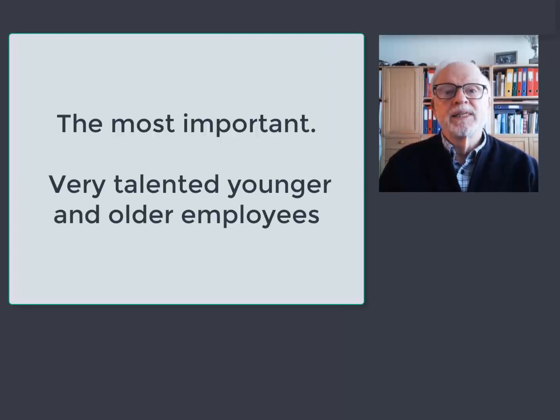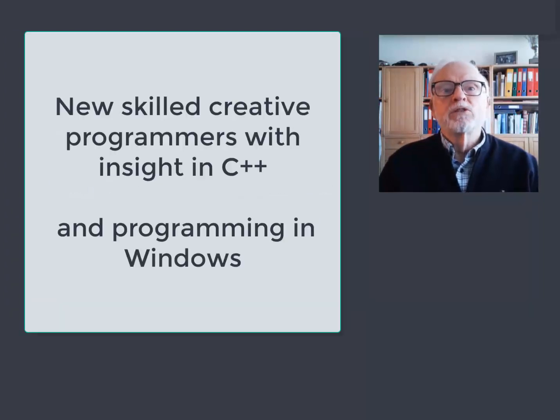The younger talented Labka programmers on the HP 1000 wanted us to get more familiar with the new technique on the PC side, something other than just Fortran on the HP 1000. They chose the IBM PS2, DB2 and the programming language C. That was around 93. We lacked solid knowledge and experience with object-oriented programming in C++, but it came with the new people in 95.